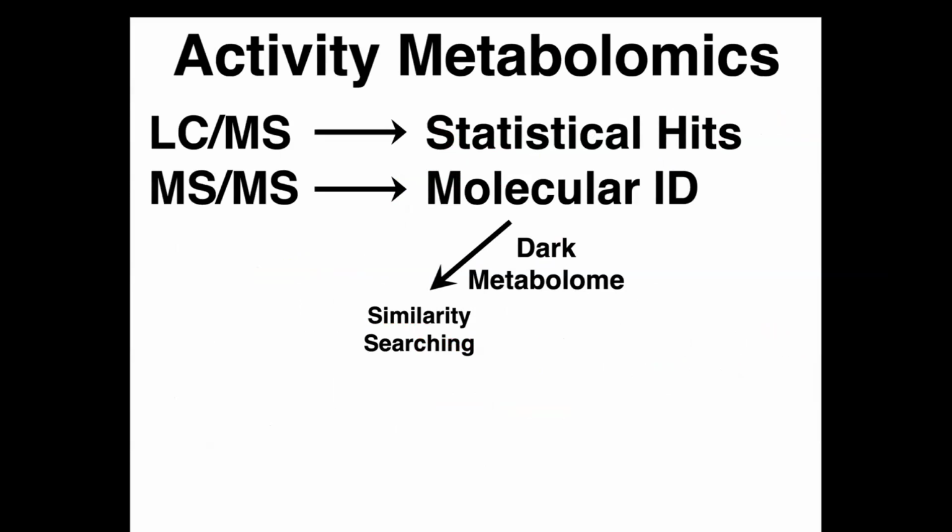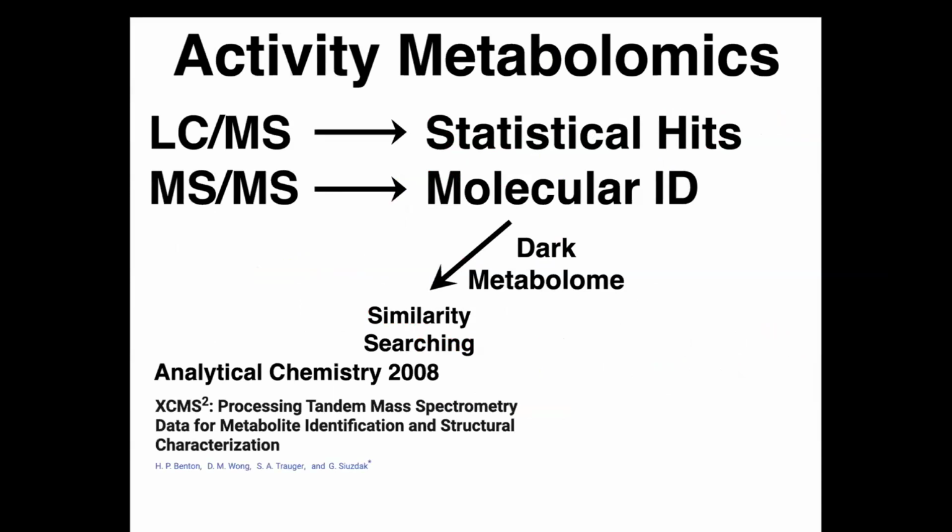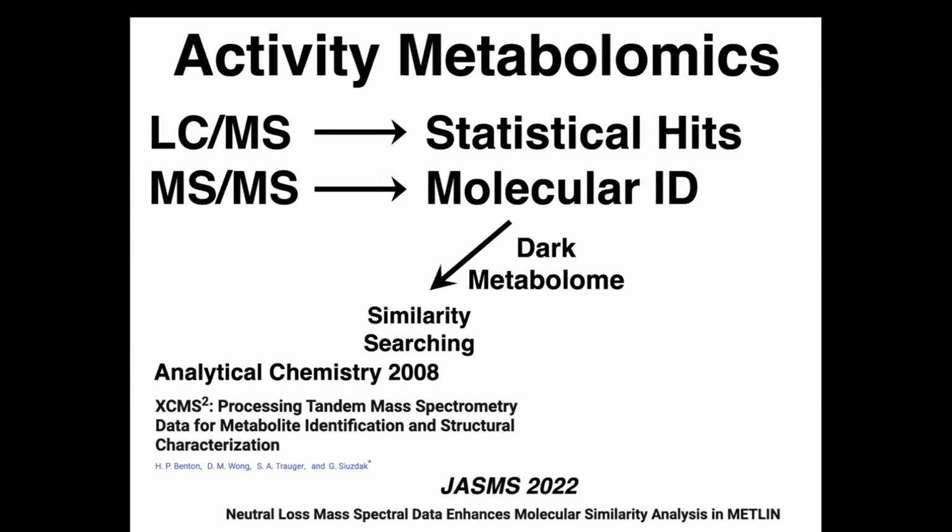So I'd love to be telling you right now that the technology that we introduced back in 2008 was going to be useful for identifying these molecules, but unfortunately, I'd have to say, based on this and other work that we've done, that similarity searching has been somewhat disappointing in coming up with molecules that are structurally similar.